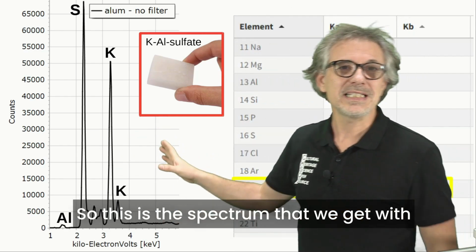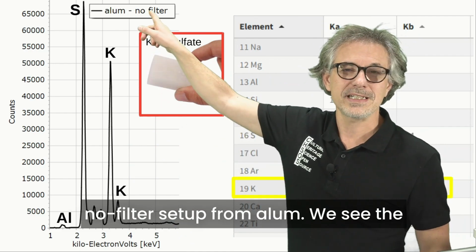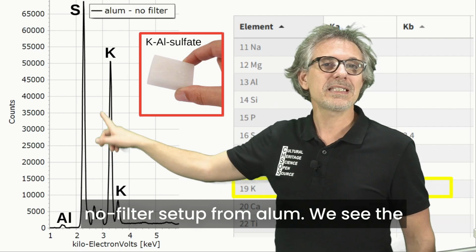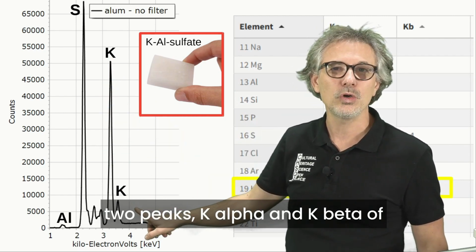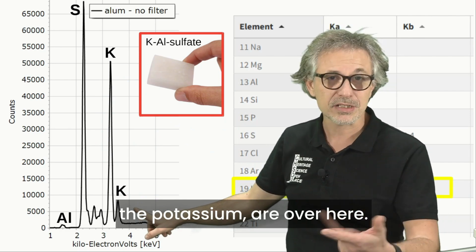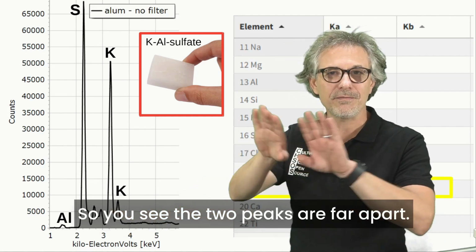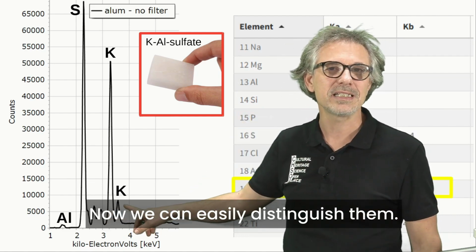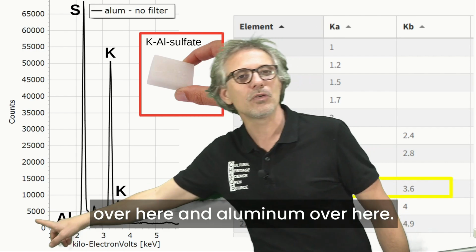Well, there it is. This is the spectrum that we get with the no-filter setup from alum. We see the two peaks, K-alpha and K-beta, of potassium over here. You see the two peaks are far apart now, so we can easily distinguish them. And then we also see sulfur over here and aluminum over here.